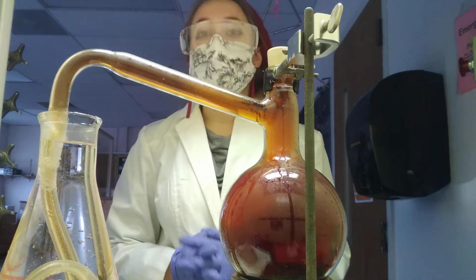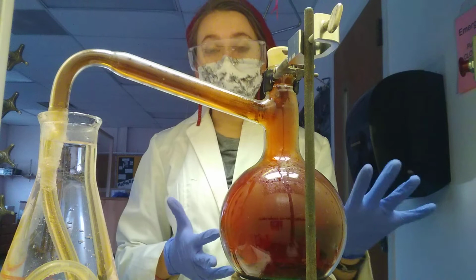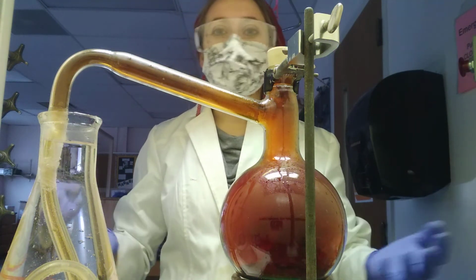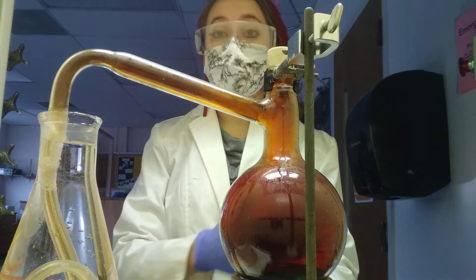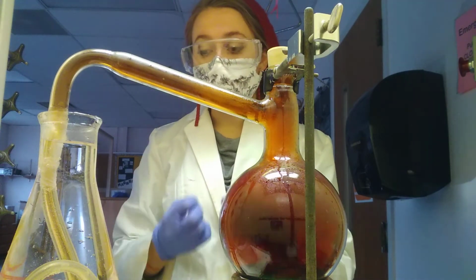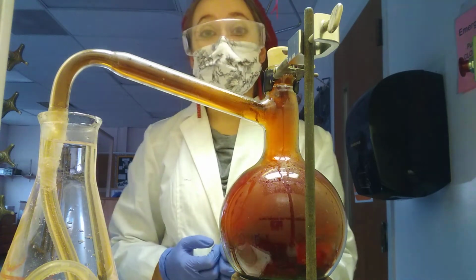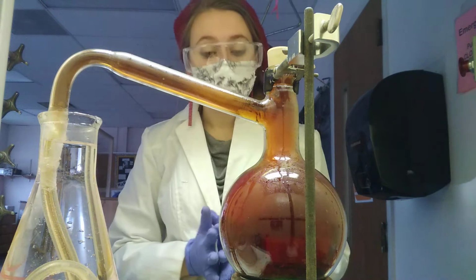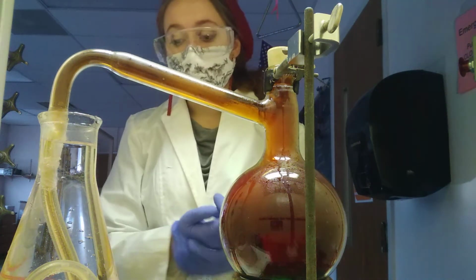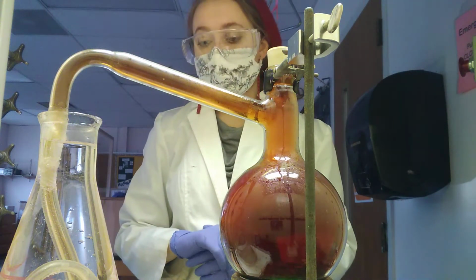Obviously, that also happens when you have a phase change, which is why people get phase changes confused with a chemical change. They're not. A phase change is just moving from whatever phase, and there's not any real chemical difference. Another thing that you can look for is a color change, which we have obviously had. We have this green solution that is at the very, very bottom, and then we also have this brown NO2 gas.